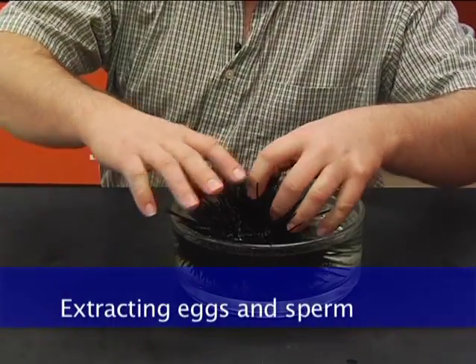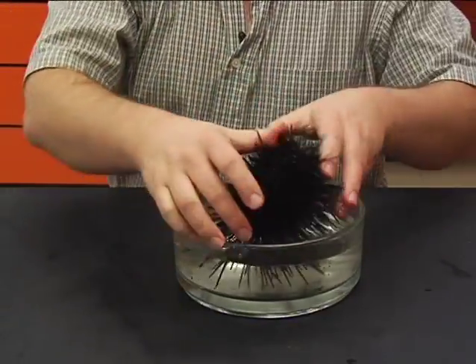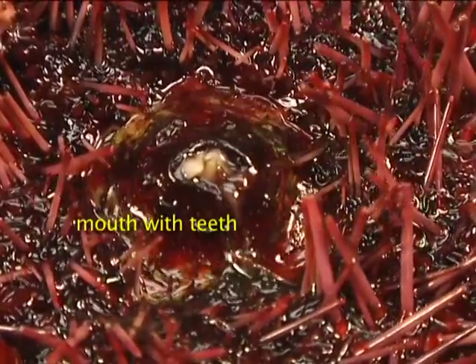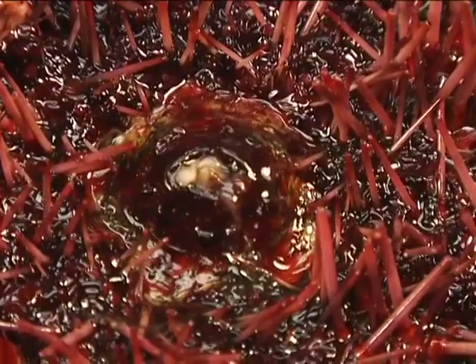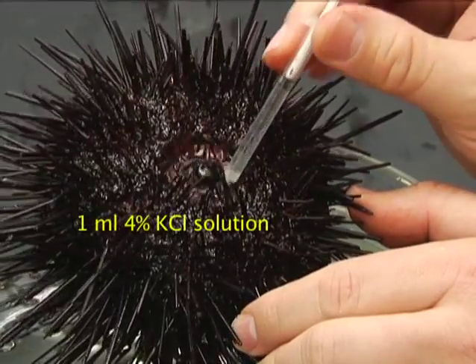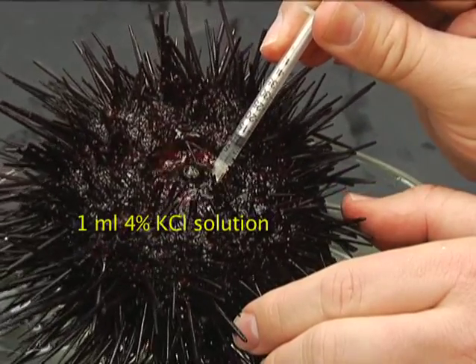Turn the urchin over to expose the oral surface. Inject one milliliter of four percent potassium chloride through the membrane surrounding the urchin's mouth.